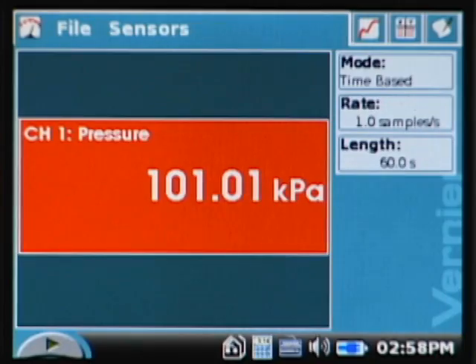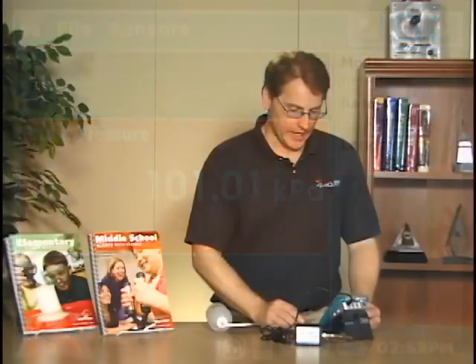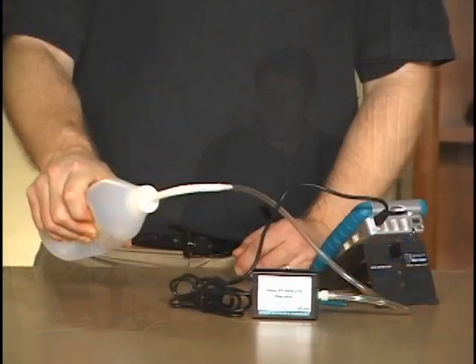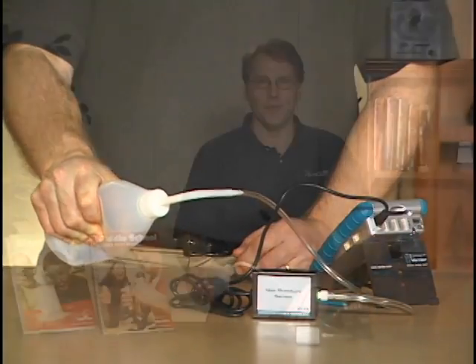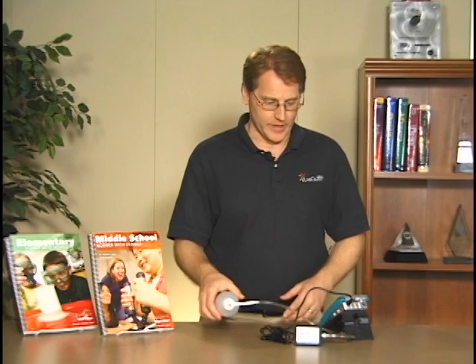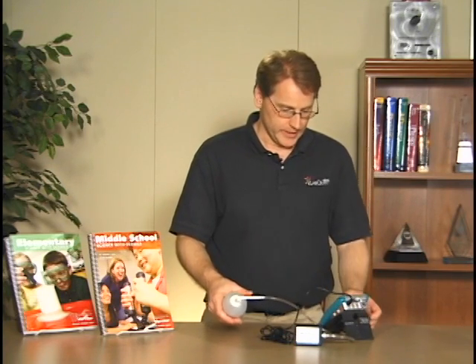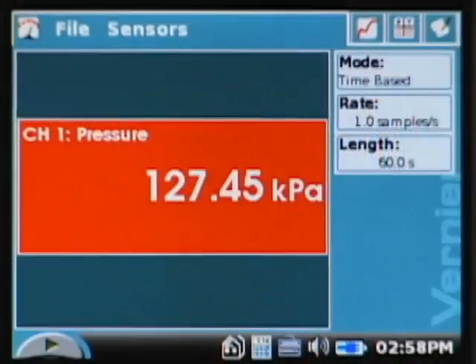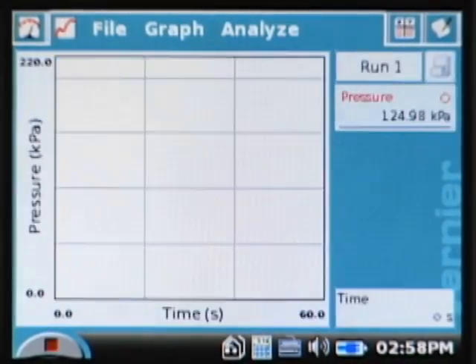Now our experimental length is 60 seconds, and I'm ready to collect. What the lab has the students do is they're going to squeeze the bottle, and they'll do it with their left hand and then they'll end up switching it over and doing it with the right hand to do a comparison. I'm ready to collect.